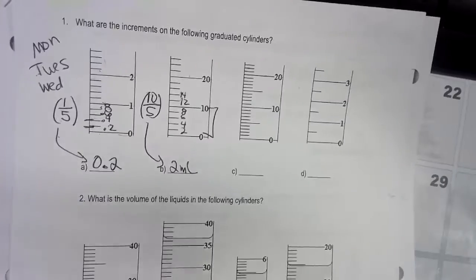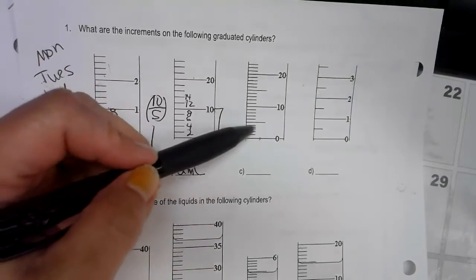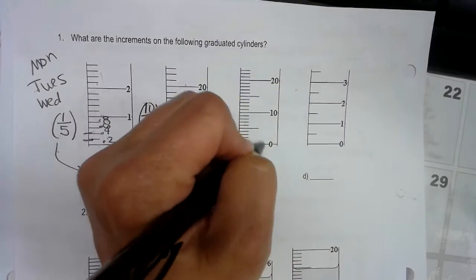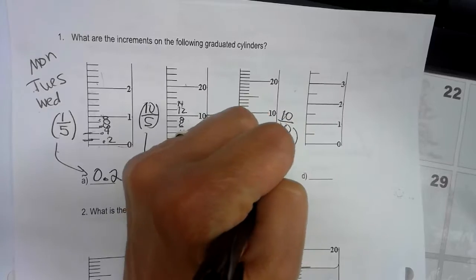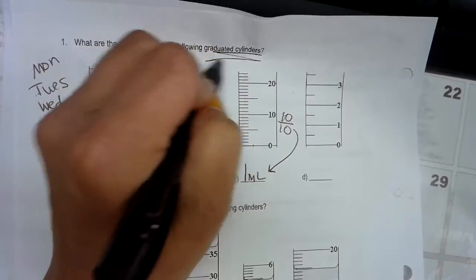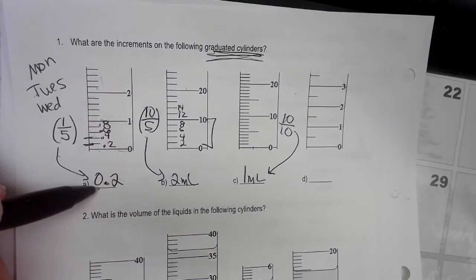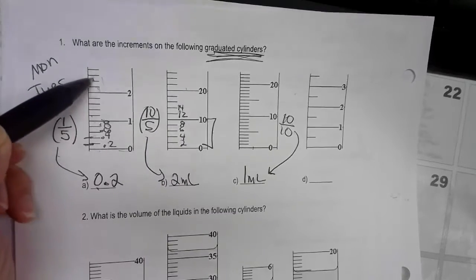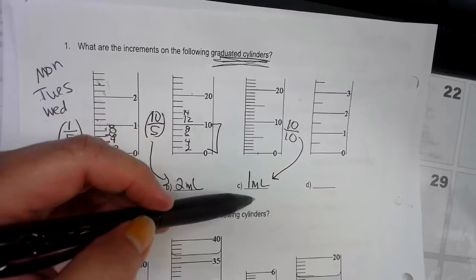Okay, you could have the same kind of space between 0 and 10, and you'd have 10 increments. So 10 units divided by 10 lines would make it come out to be 1 mil. So we're all basically talking about milliliters in a graduated cylinder, and this would represent 0.2. So that would be like 1.2. This would be 2.4, and so forth. When you have 10 lines in 10 mils, each one is 1.